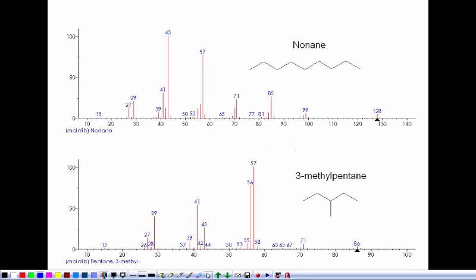But basically, the nuts and bolts of what we learned last time in terms of the mass spectrum is that the peak that is farthest to the right is what we call our molecular ion peak or our mass peak. And so it's our M dot plus, it's our radical cation, it's the molecule as it is intact. Then that molecule, once it becomes a radical cation, becomes kind of unstable, and so it begins to break apart. And as it breaks apart, we get these other peaks, which are going to be fragments of different masses. And so in theory, these are the pieces that when you put these pieces together, you get the molecular ion. And the question is, well, how can I interpret those pieces? What do they correspond to?